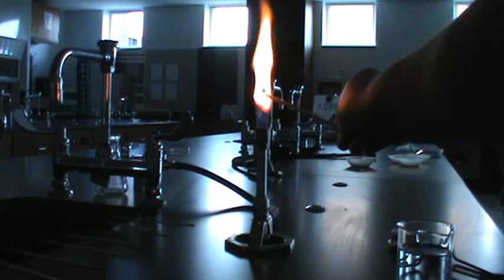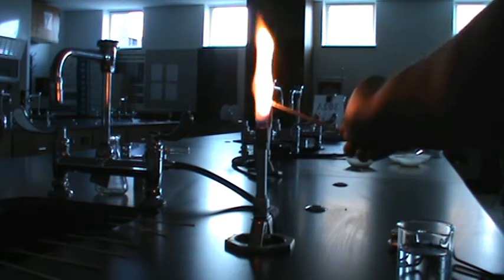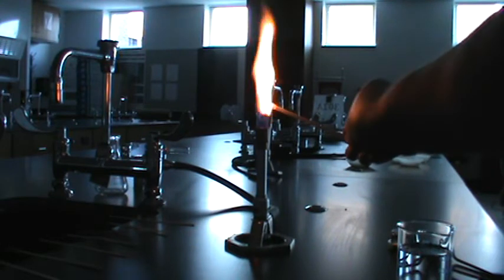Now, hopefully you notice that with the flame, it's kind of a bluish color. We're going to see what color the flame changes to. So let me reach back here and let's just kind of see what we see. Okay.